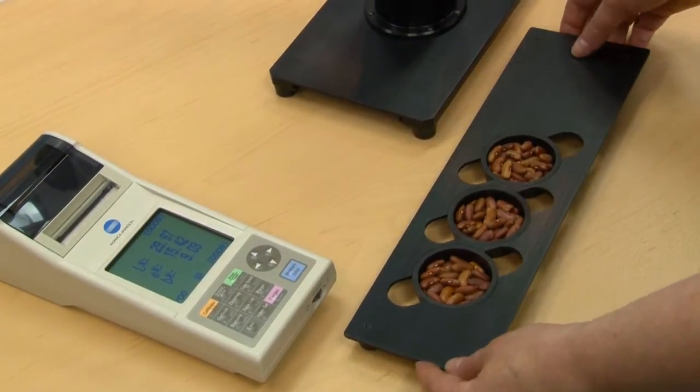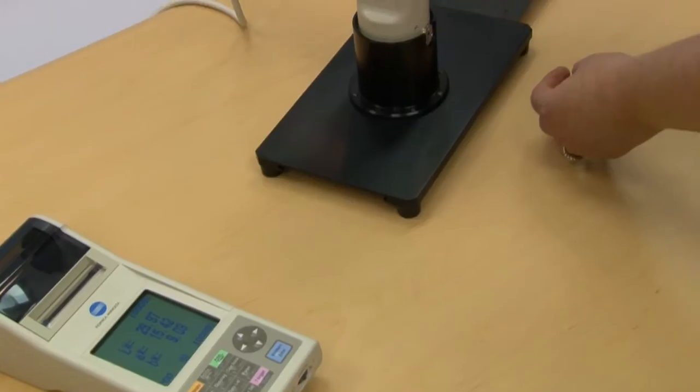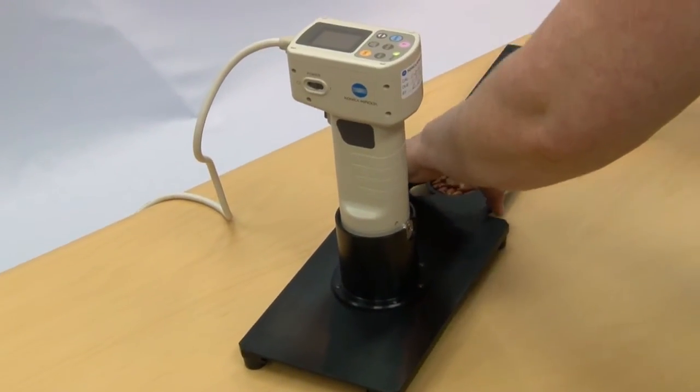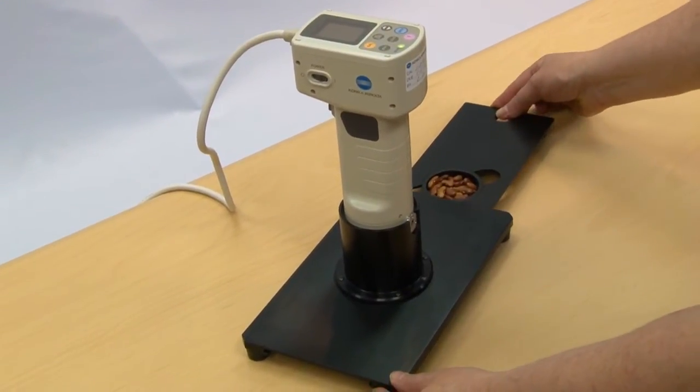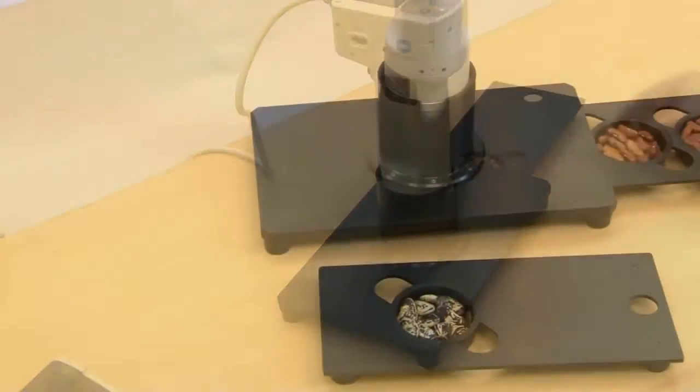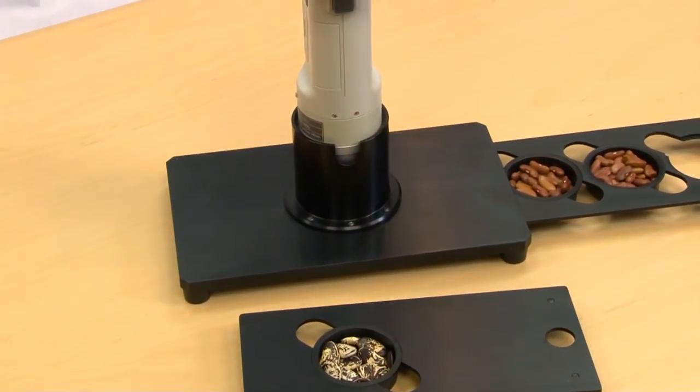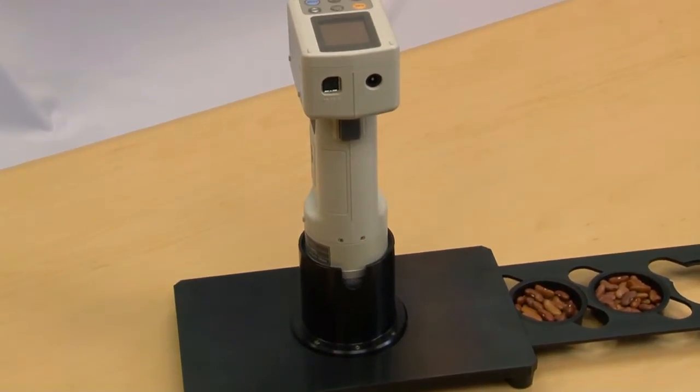The CR410 sample holder can be used with fine powders, granulars, as well as large samples such as beans shown here. This holder is not recommended for liquids. This has a single-cup sample holder or a multi-cup holder, which holds three cups.